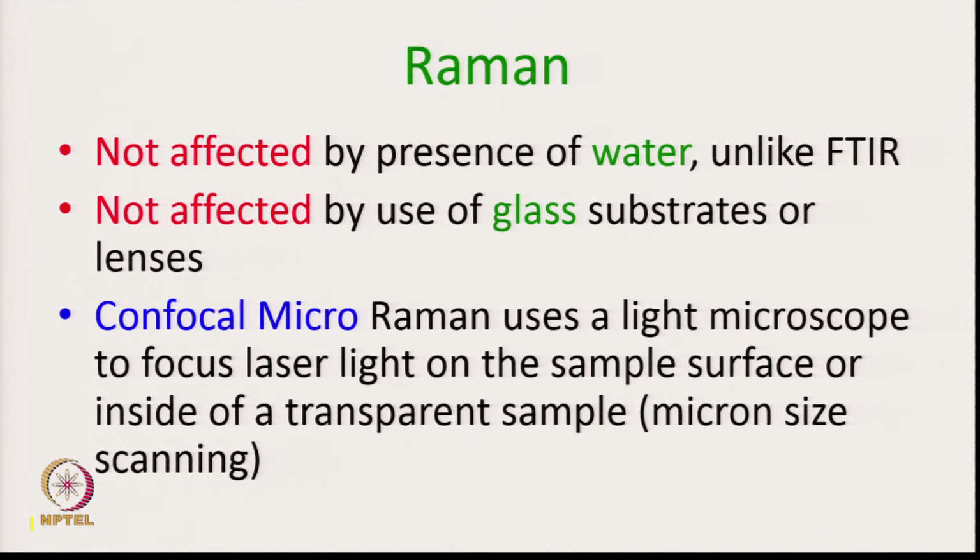Just to remind you again, the importance of Raman is that it is not affected by water. You can actually do a reaction inside water and monitor the growth of the reaction. You can also look at a material or textile which is heavily loaded with water and see the changes that have taken place. Another interesting thing is, unlike IR, you can use glass. Raman is transparent to glass, because it happens in the visible region.